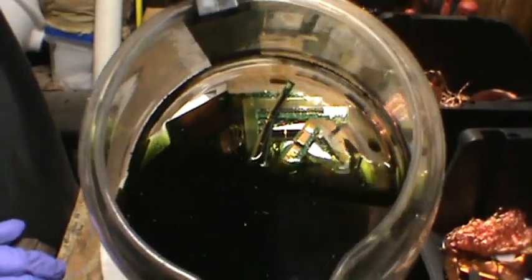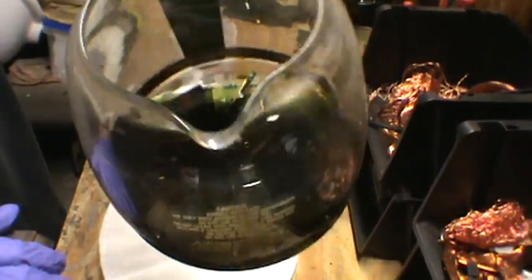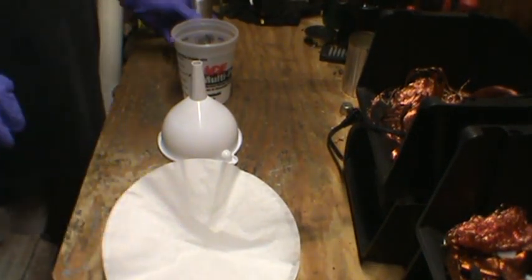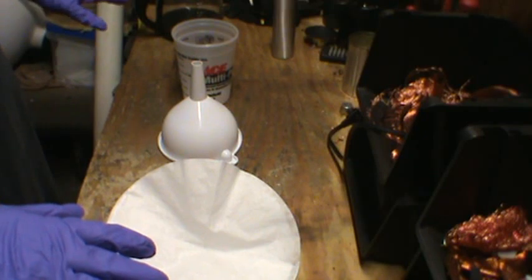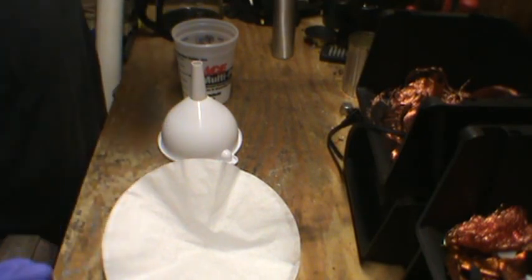Alright, so we've got the acid mix in here. For the most part, most of the gold foils are off. However, for the sake of this video, I'm just showing how it's done — I'm not going to wait until all the foils are off. Normally, you'd let it soak. This is day two, so probably by day three or four most of them will be off. Could take more time, could take less.